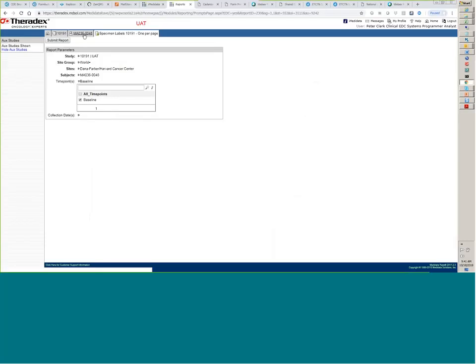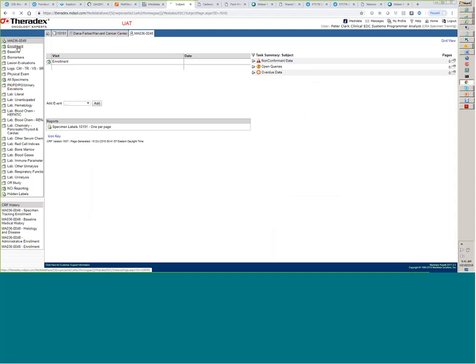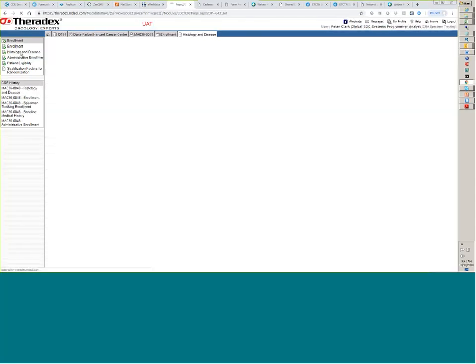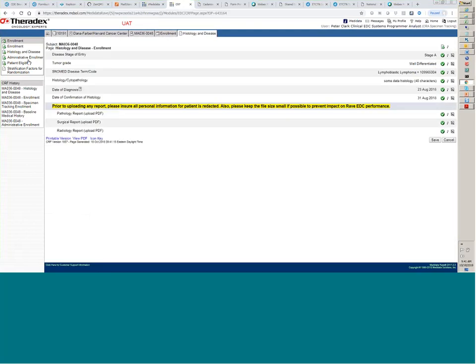Back in the RAVE environment now, if we go back to that enrollment form, I'm sorry, the histology and disease form within the enrollment folder, I can upload a pathology report.